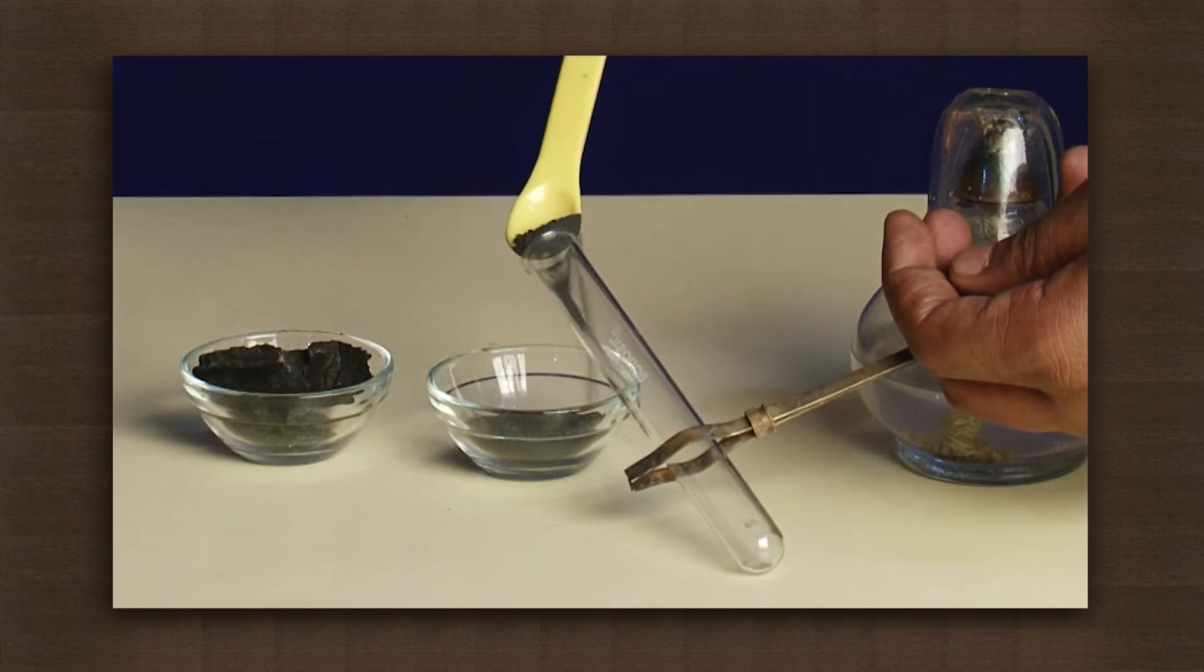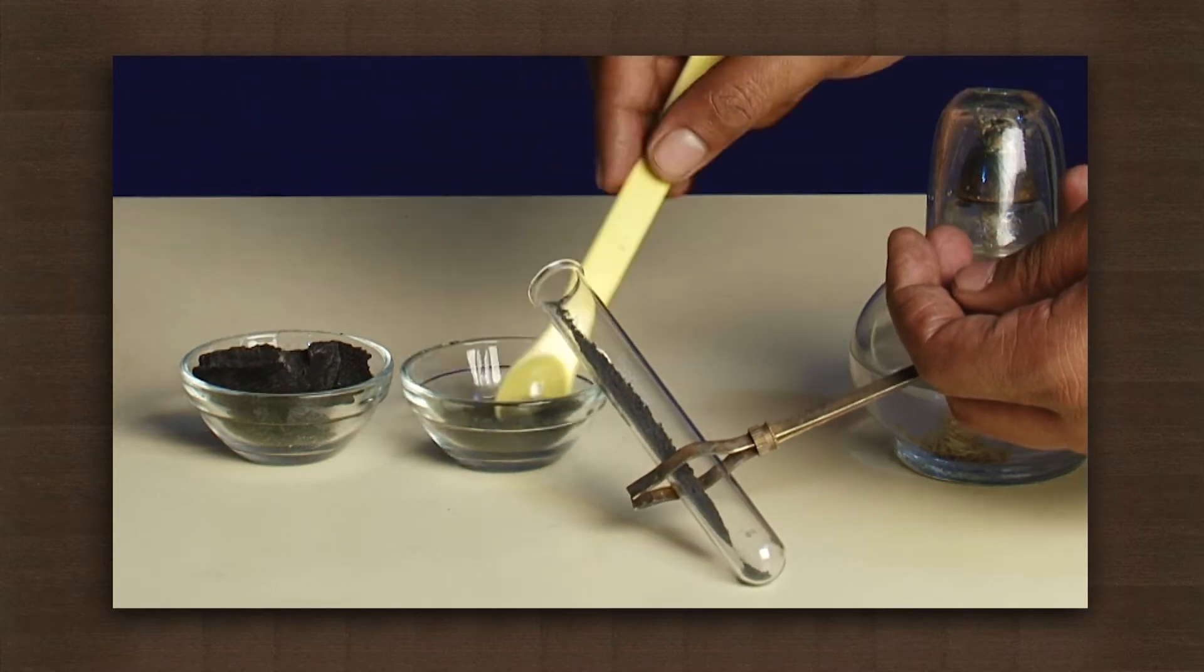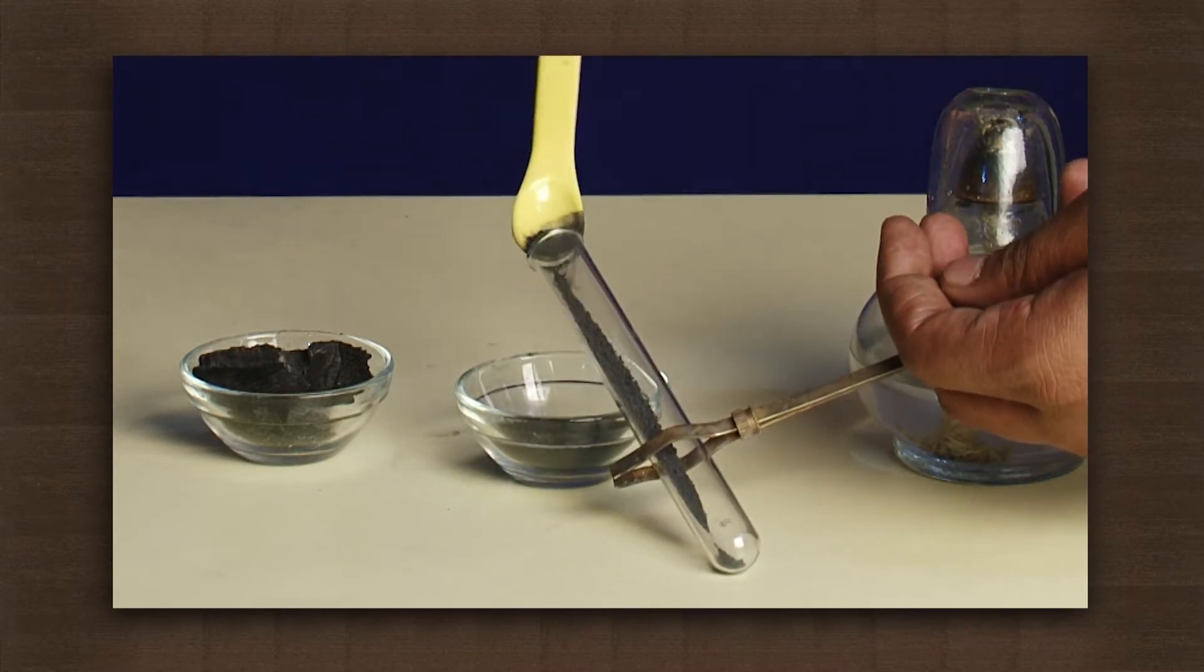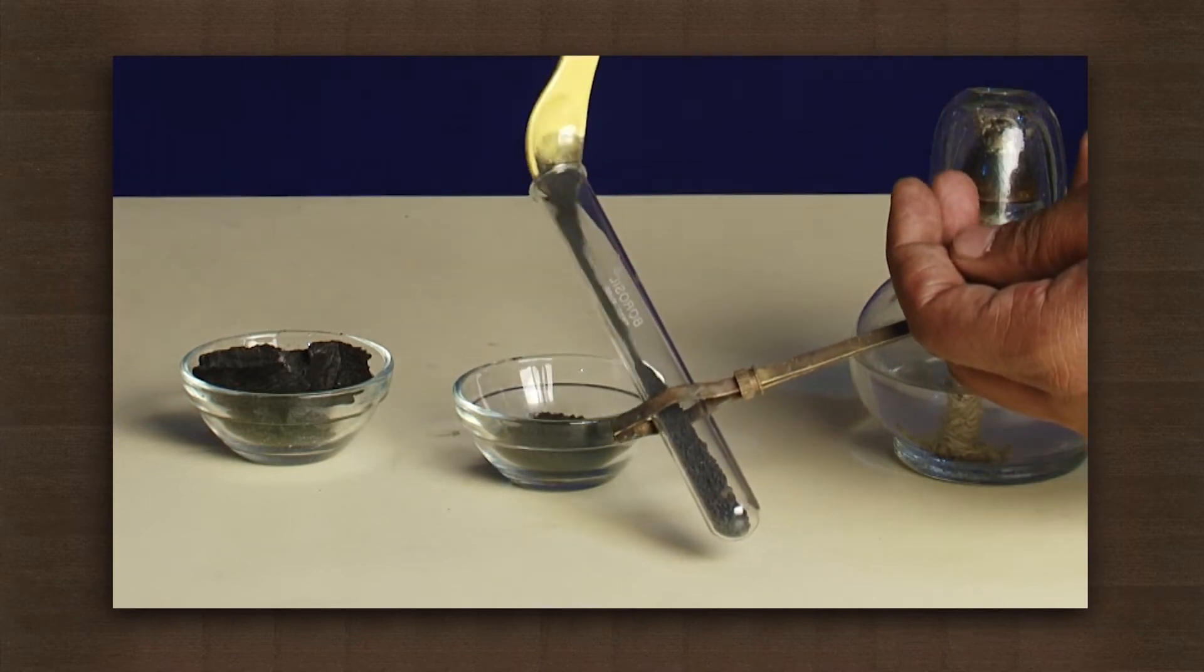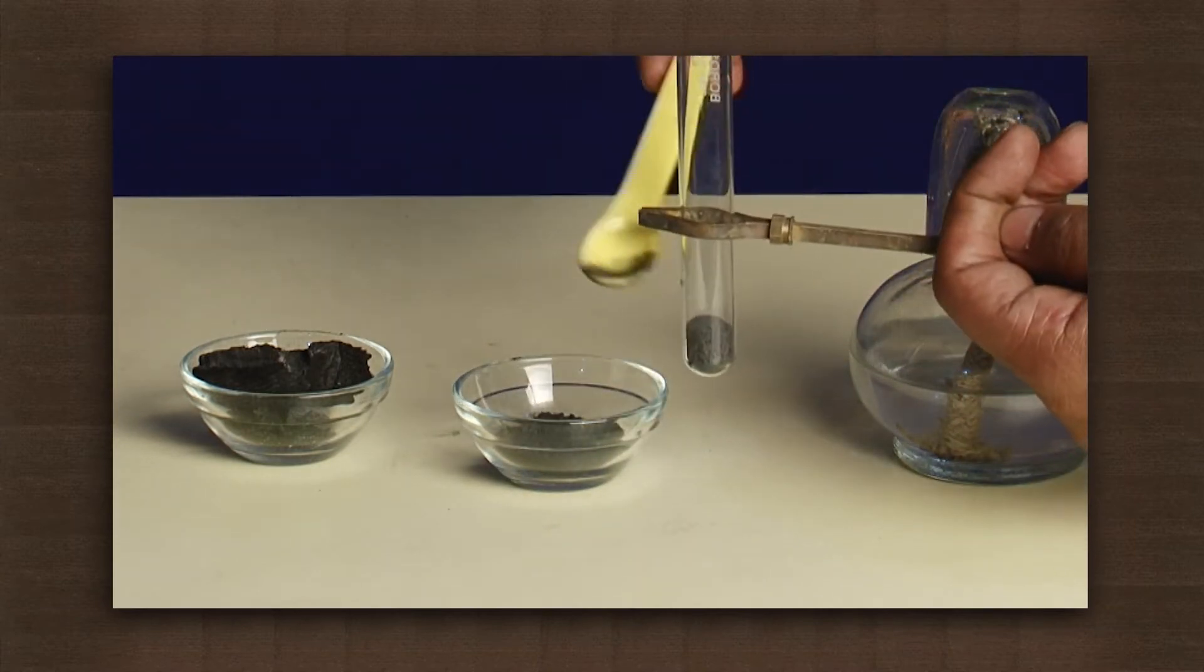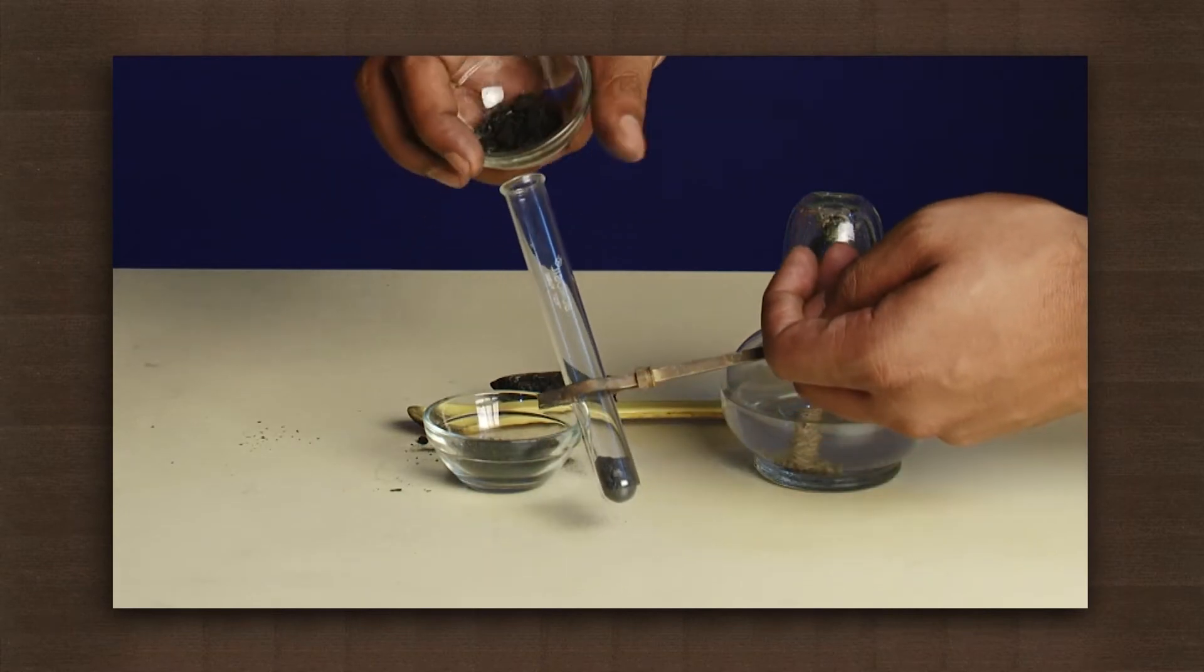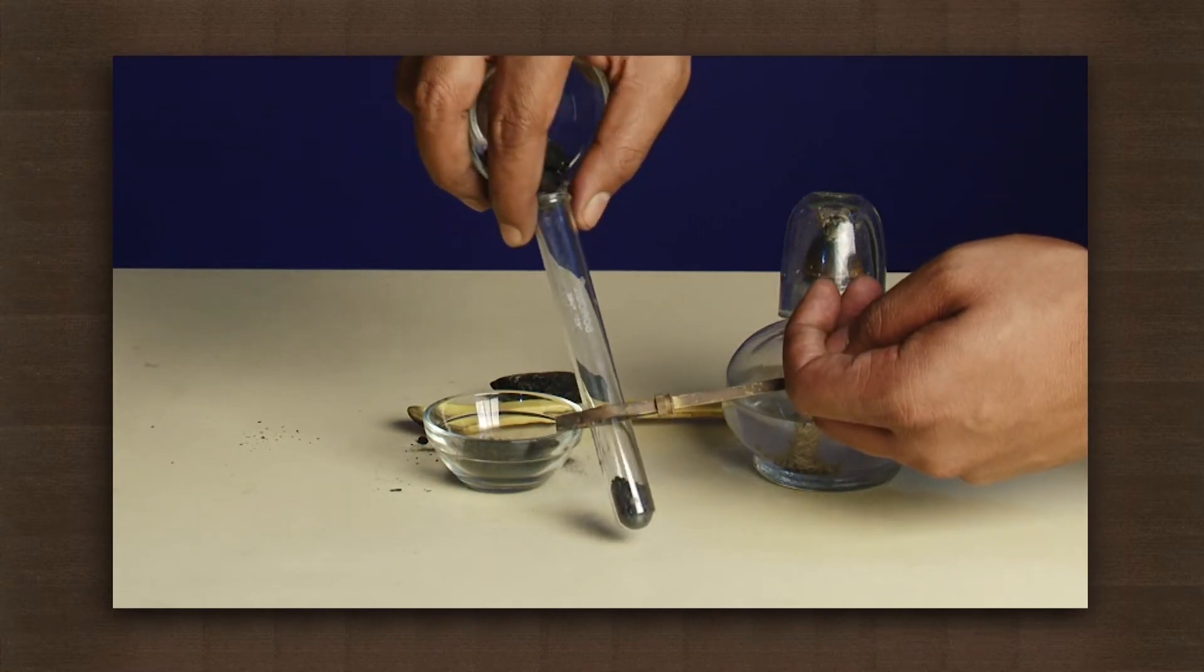Put some copper oxide in the test tube. Now add some charcoal powder on top of the copper oxide without any mixing.